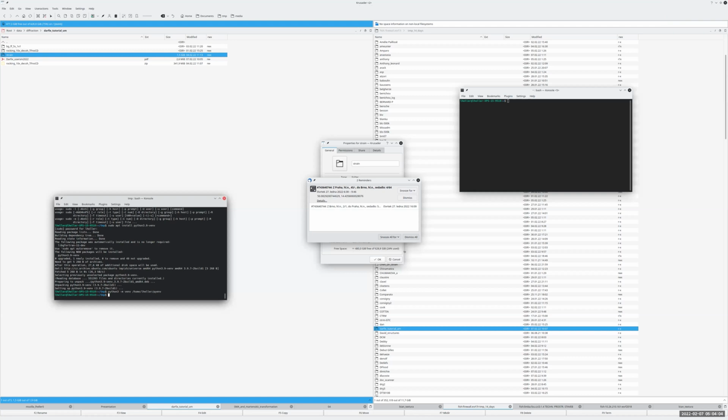Now you execute it. You created it, and now you can activate it, also following the source path and activate. It's activated. The underscores are to be omitted, right? I do see some underscores. This is perfect.